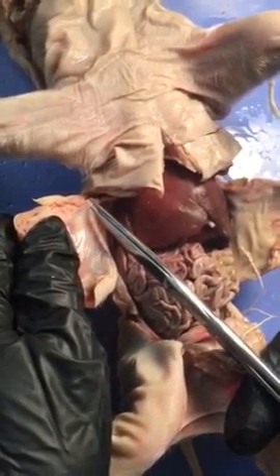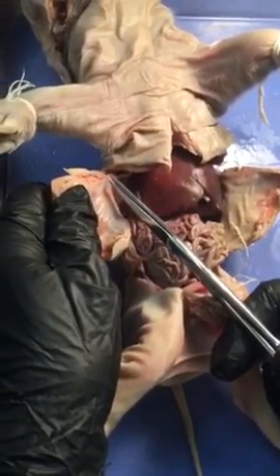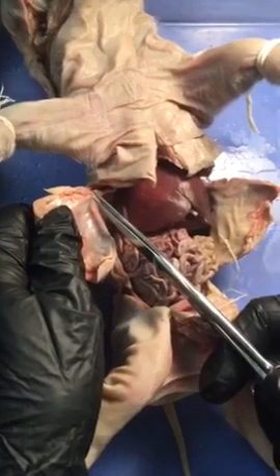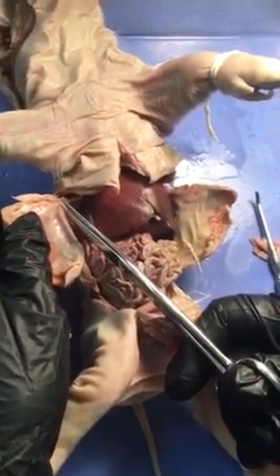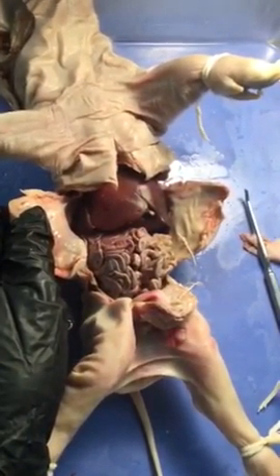Peritoneum. Okay, which part of the peritoneum? Everybody see it? Parietal peritoneum. The abdominal cavity is lined with the peritoneum. Okay, it has 2 layers, just like everything else, the visceral and the parietal. In this case, the parietal lines the cavity that these organs are in.